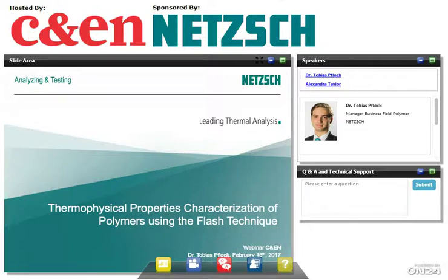So today I will present the webinar on thermophysical properties characterization of polymers using the flash technique, and I would like to show you how this technique can tell you more about thermal conductivity and transport properties of a wide range of polymers. As Alexandra pointed out, I will be available for question and answer afterwards as well.